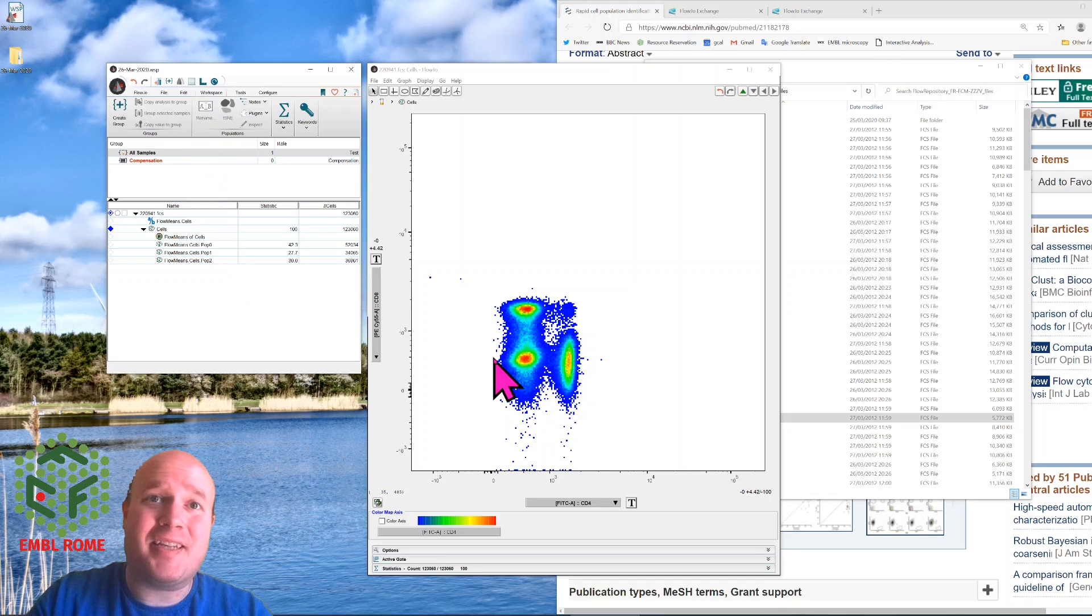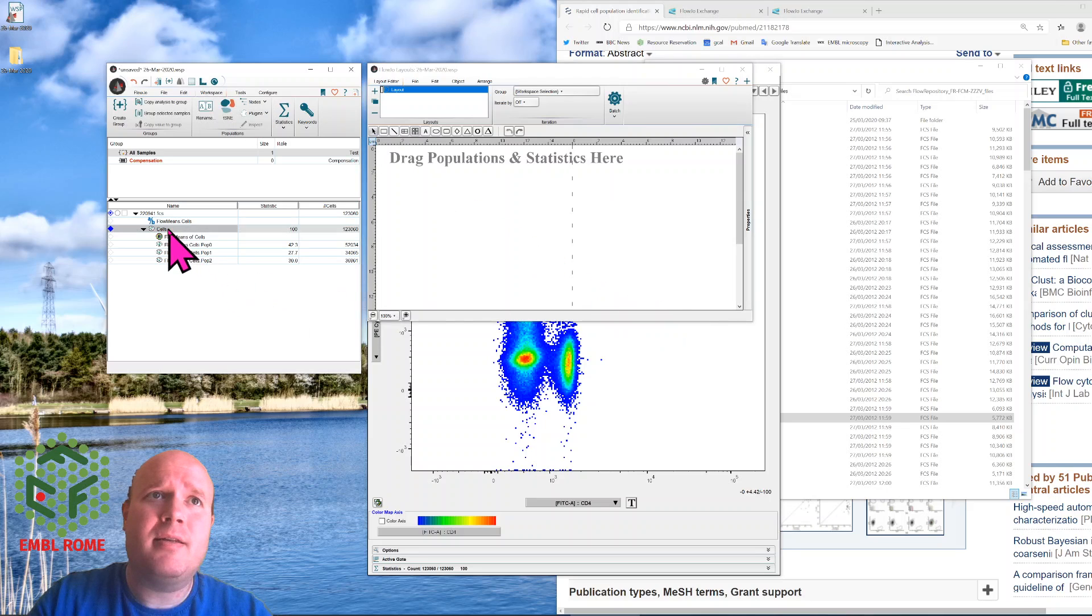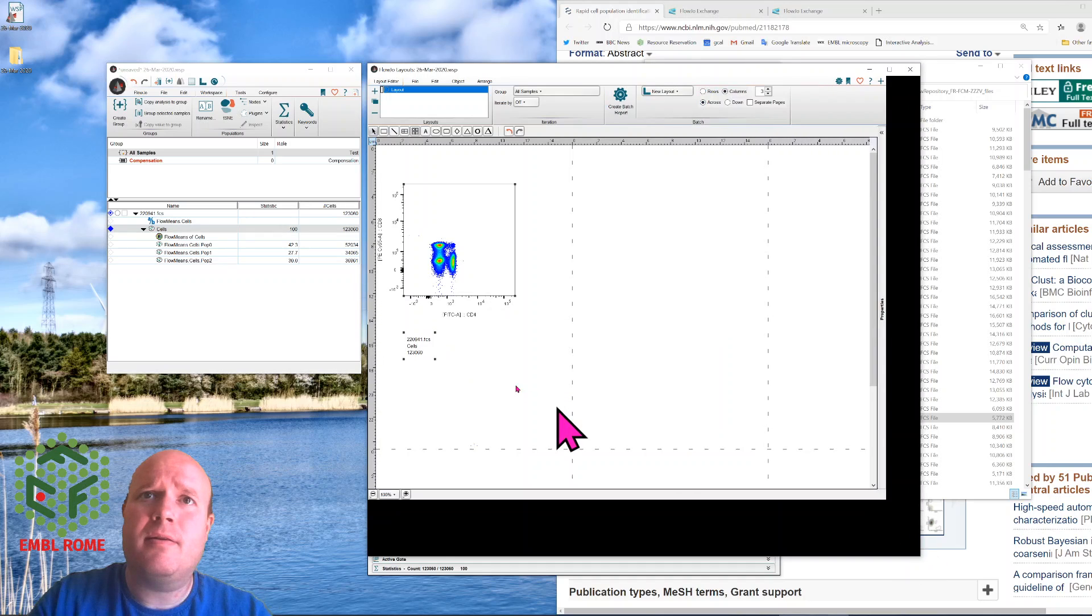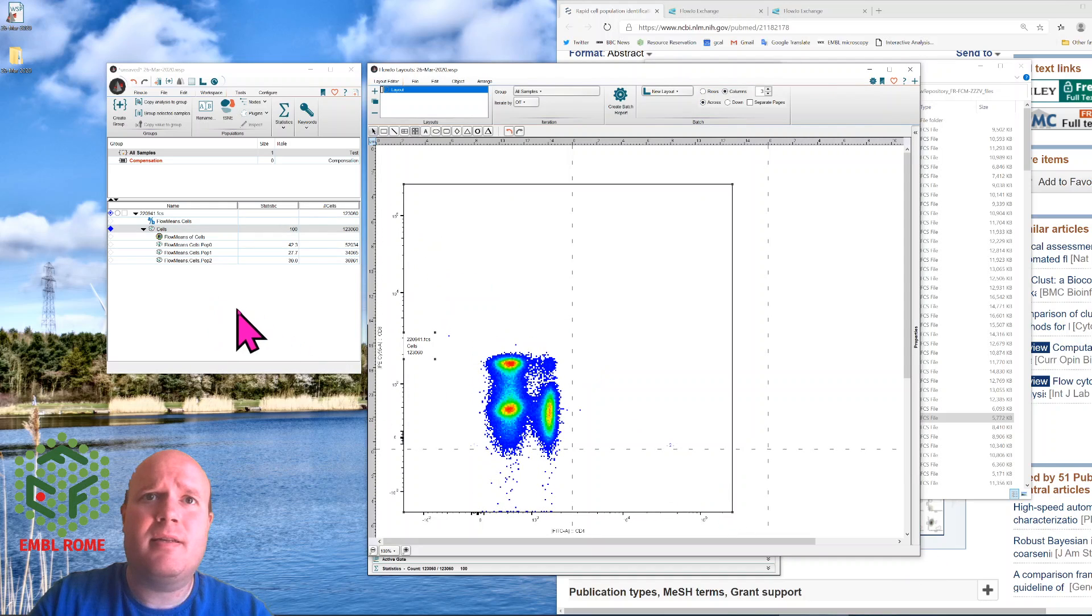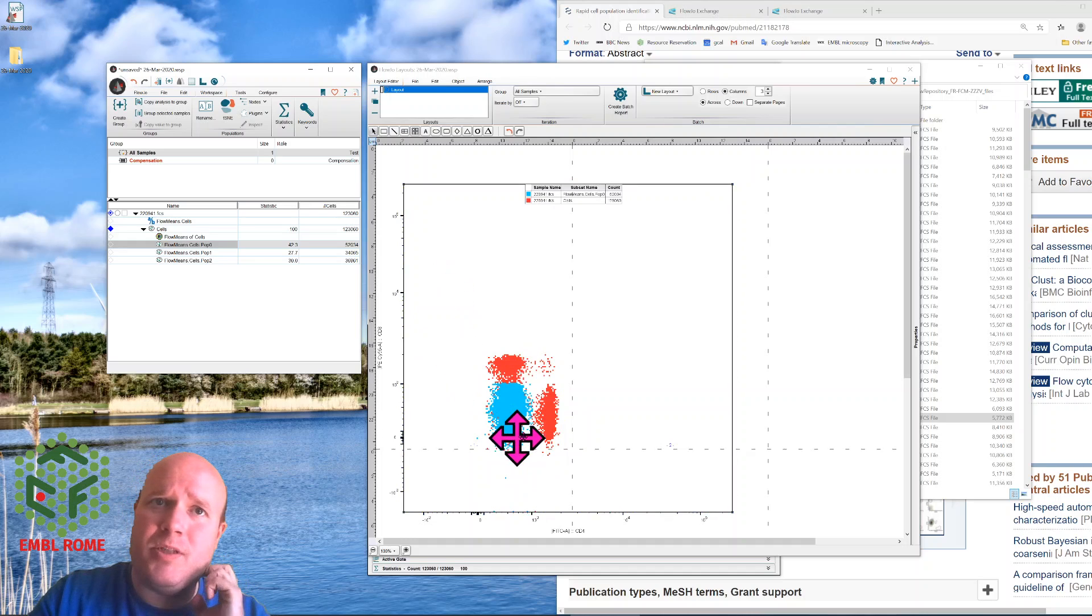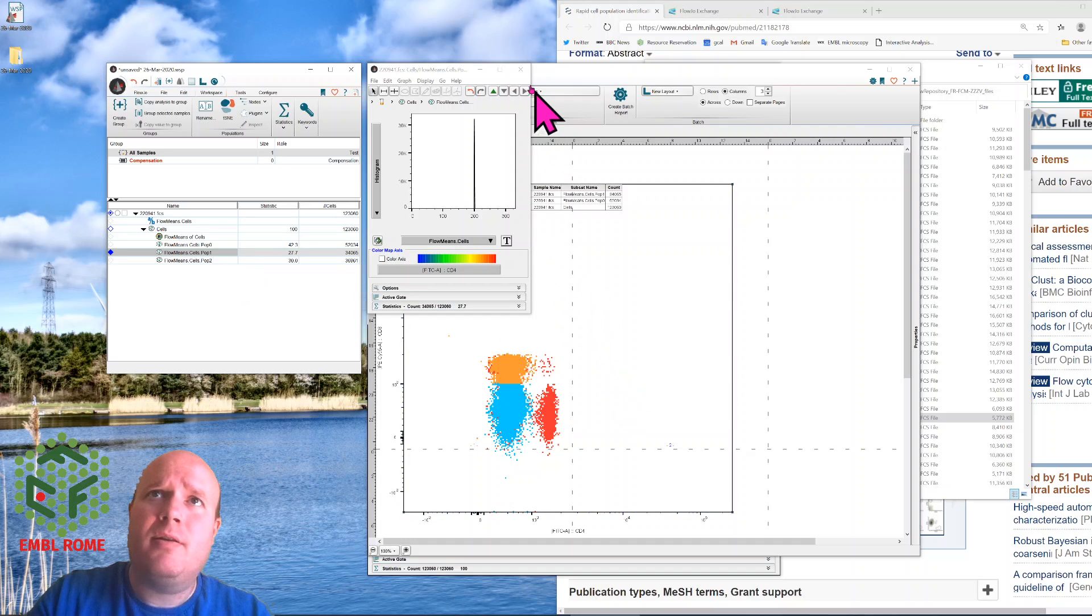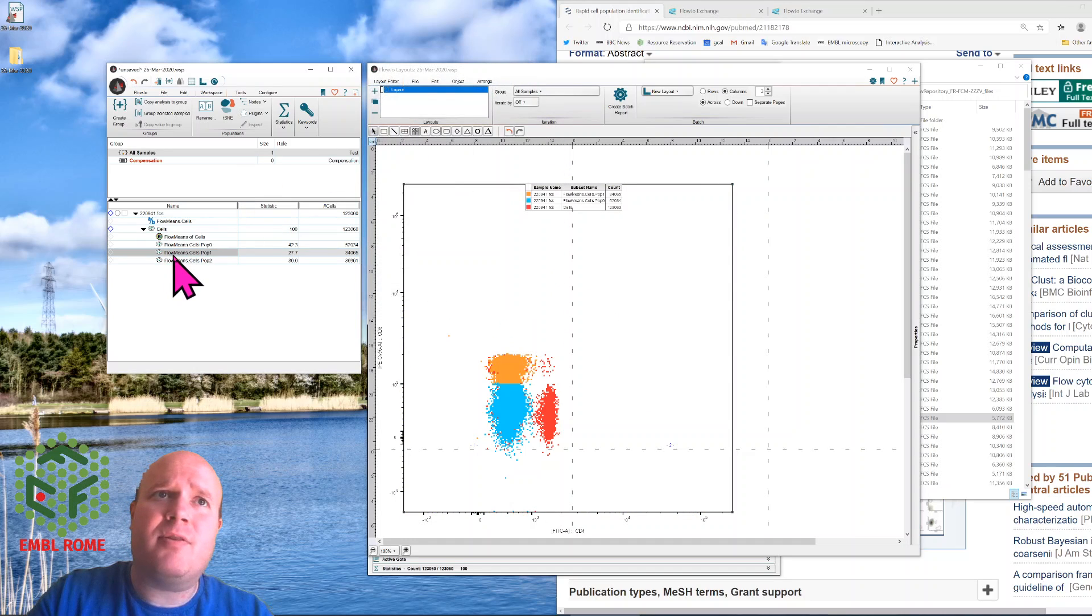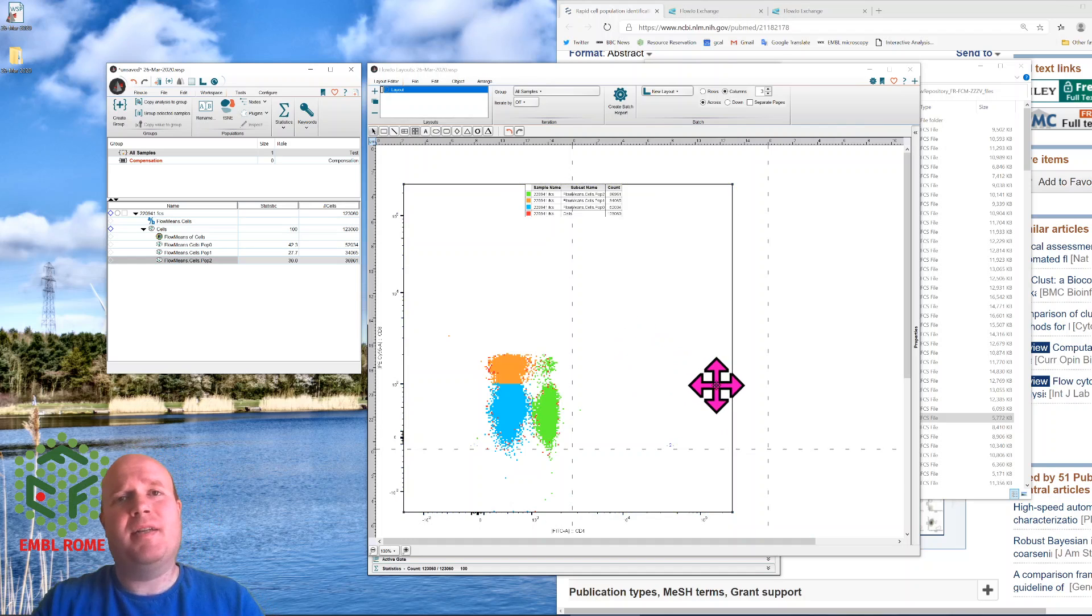It doesn't actually create the gate here, which is a little bit annoying, but the easiest way to visualize what it's done is if we use the layout editor, bring across this cells population, make it bigger for you to be able to see, and drag across pop0, which is my double negative, pop1, which is my CD8 positive, and pop2, which is CD4 positive.